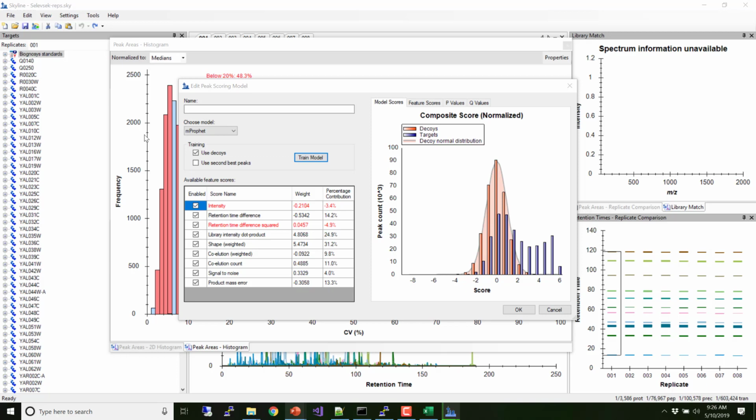that it's quantifiable, it has a linear dynamic range. They do repeatability, so they do these 5x5 experiments where they measure it 5 times on 5 different days, and there's a pretty rigorous amount of stuff that you need to go through. This is just taking one little piece from that world over here, and we're just saying this is a bit of a repeatability experiment. Can I measure this peptide repeatably and get the same answer?